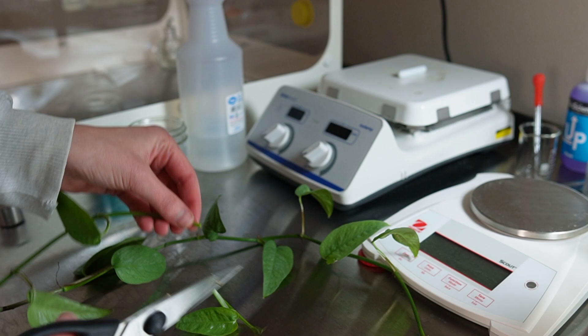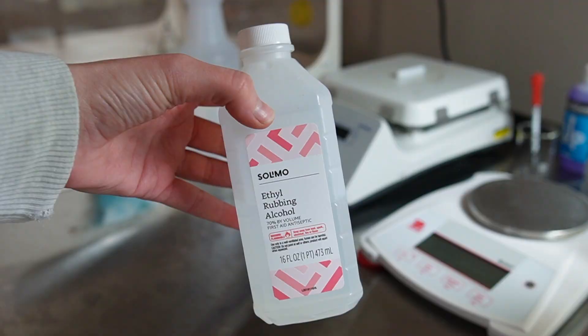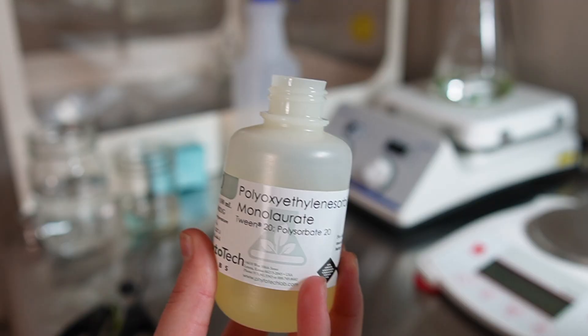For my explants I'm using nodal sections and also some shoot tips. I'm planning to use four explants per jar since I have such a big plant. I first clean the explants by placing them in water with a drop of Tween 20 and agitating for about 10 minutes to remove that surface layer of dirt. After that I place the explants in 70% ethanol for one minute, followed by a 2% bleach solution for 25 minutes.